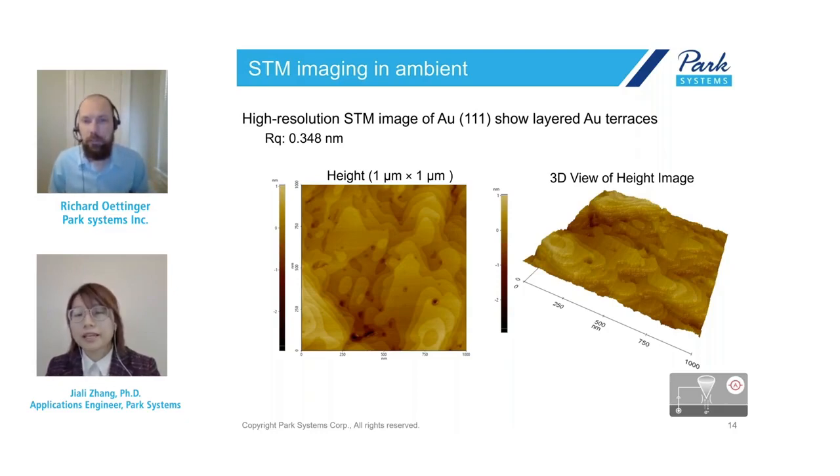For PinPoint, it's taking a force distance curve at each pixel. Therefore, at each pixel, the tip will lift up and move to the next position. And the lift height will be several hundred nanometers or 1 micron, depending on how you define it. Since the lift height is so tall, it will definitely pull your tip away from the adhesion force regions, which is within 1 nanometer or 5 nanometer regions.